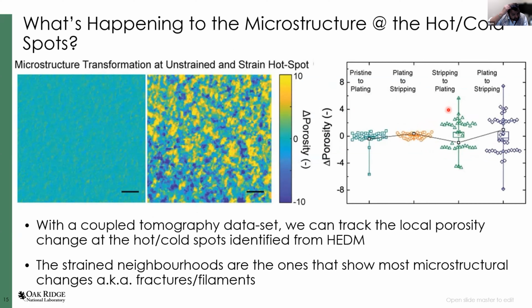In the solid electrolyte world, it is understood that a change in porosity in the tomography scans is consistent with formation of cracks or lithium filaments where you deposit lithium, because within the bulk electrolyte there is not enough contrast to distinguish between pores and lithium metal. So any change in the X-ray transparent, less absorbing region, we essentially think of as a crack or lithium filament.